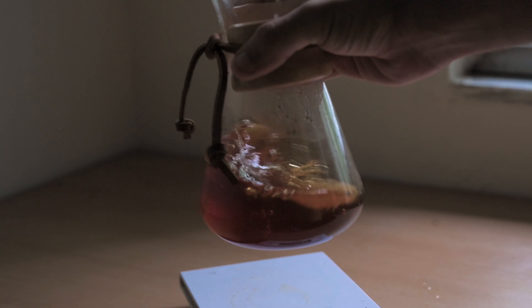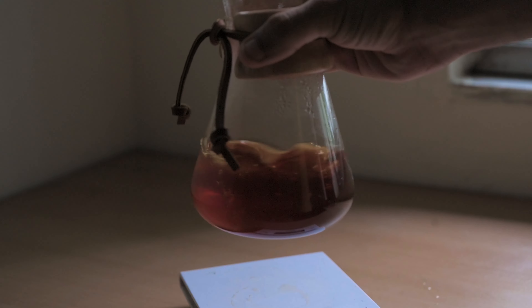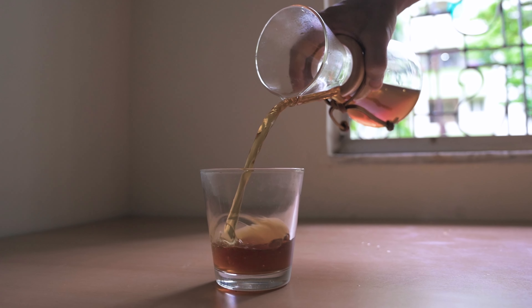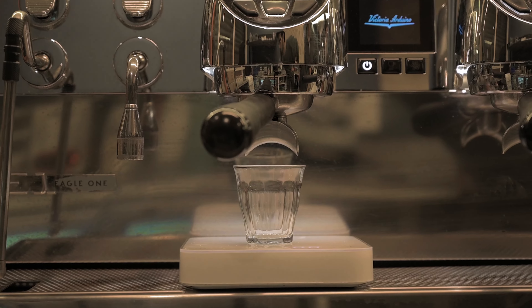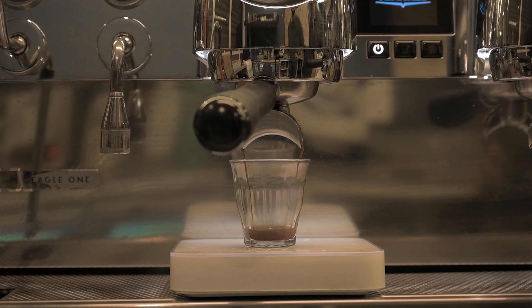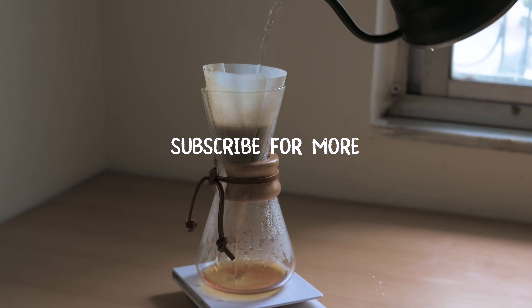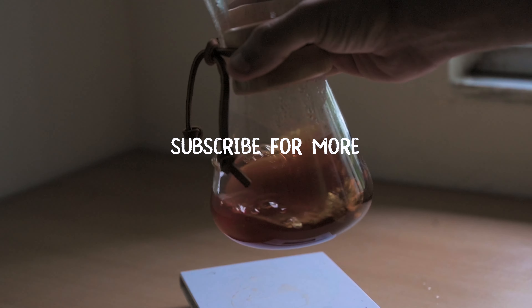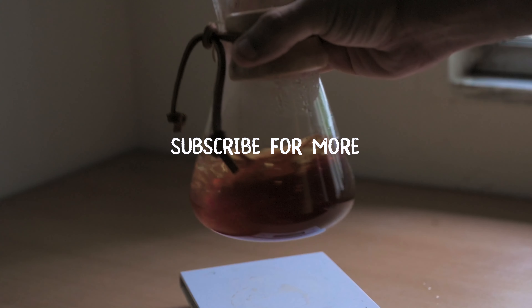To find the extraction yield percentage, multiply the brewed coffee volume by the refractometer reading you've gotten, divided by the dose — the coffee grounds used. In this case we used 220 ml of coffee, the reading was 1.33, so multiply 220 by 1.33 and divide by 15. The number you get is 19.5, which is a good number for extraction.